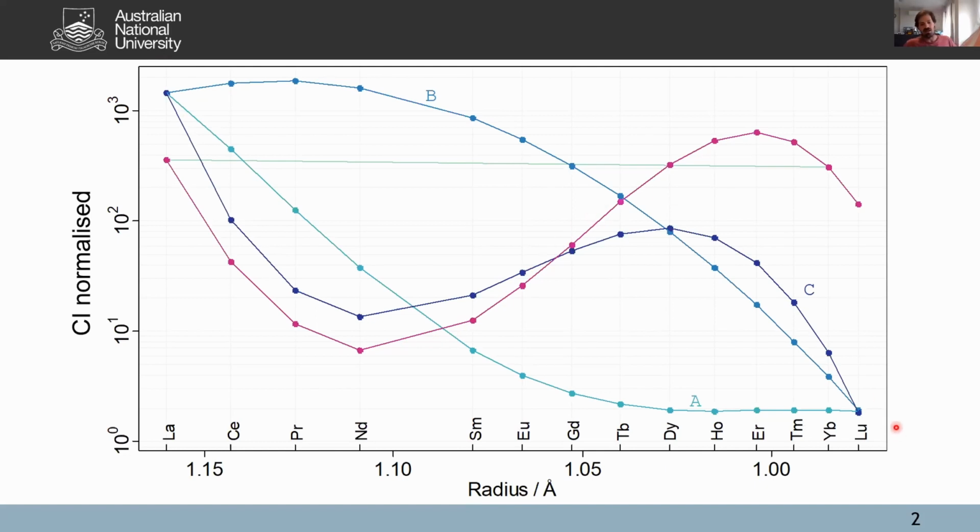And usually the numbers or the parameters we use to represent that, for example, lanthanum over lutetium, will tell you that it's overall light-rare-earth rich, but it will not tell you much about what happens in between. To do that, you will need another parameter.